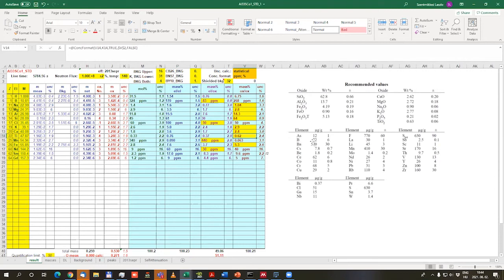For boron, we always tend to say that our method is the best for boron analysis, and we always ask the standard reference material providers to provide boron data or revise boron data, because boron is rarely specified and rarely analyzed by other methods.